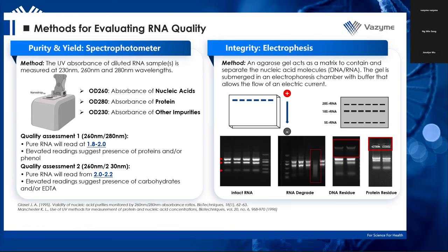The next way to evaluate the integrity of your RNA is through electrophoresis. I'm sure if you work with DNA, then you will definitely know what electrophoresis is.